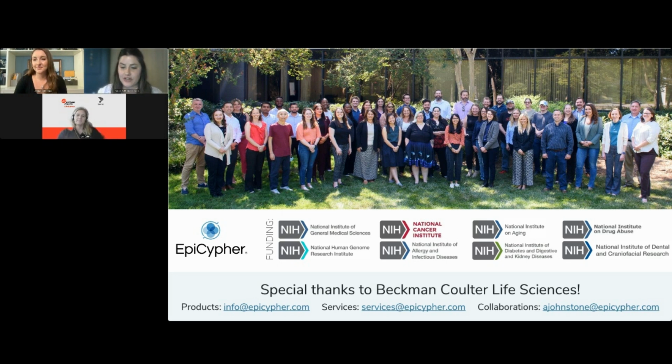Our next question asks how size selective or number of base pairs is SPRI bead cleanup versus a column-based approach? Yeah, good question. I'll let Lori chime in if she wants, but the thing I really like about using SPRIselect is that we looked really rigorously at the sizes that we were retaining at the end of CUT&RUN, doing head-to-head of spin columns versus SPRI. We've tuned the ratio of SPRI to DNA to get the same sizes. But the nice thing is that it's tunable on your end, right?